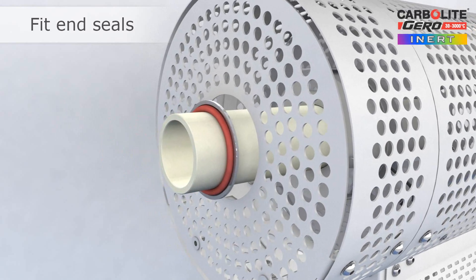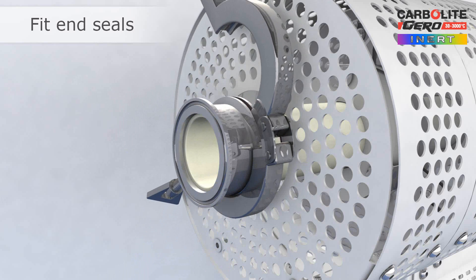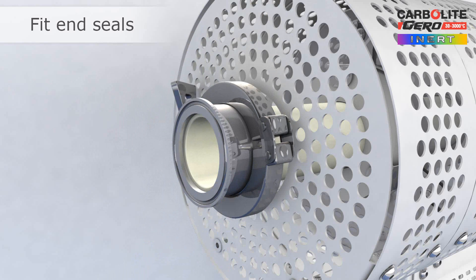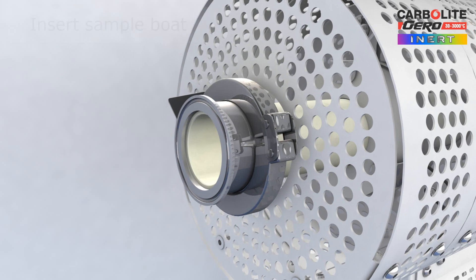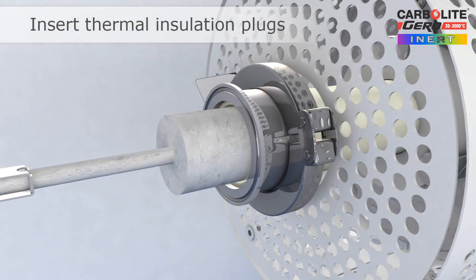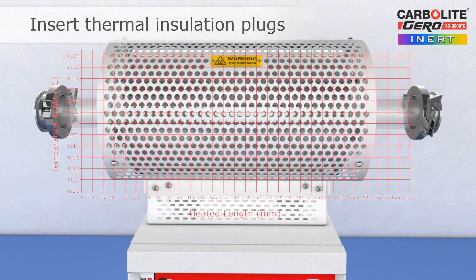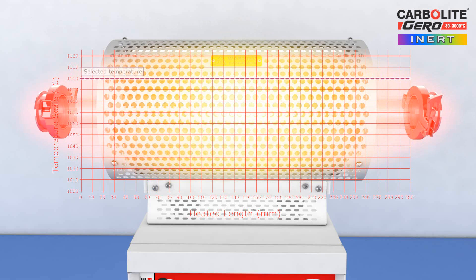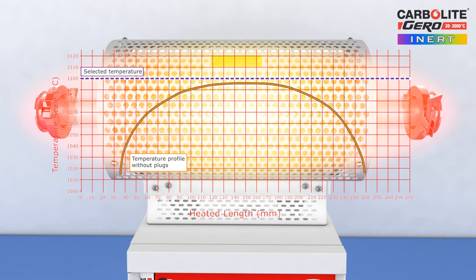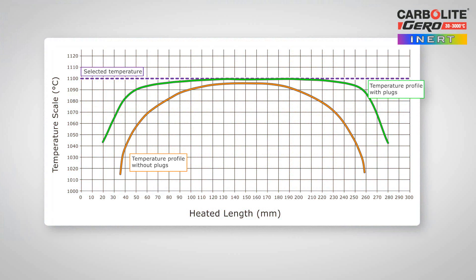The first parts of the end seals are attached to the work tube and can permanently remain in place. The sample to be heat treated is inserted into the work tube, followed by the insulation plugs. The end plugs consist of thermally efficient insulation materials and are required for three reasons: one, to prevent heat loss; two, to improve the temperature uniformity inside the work tube; and three, to protect the end seals from very high temperatures inside the work tube.